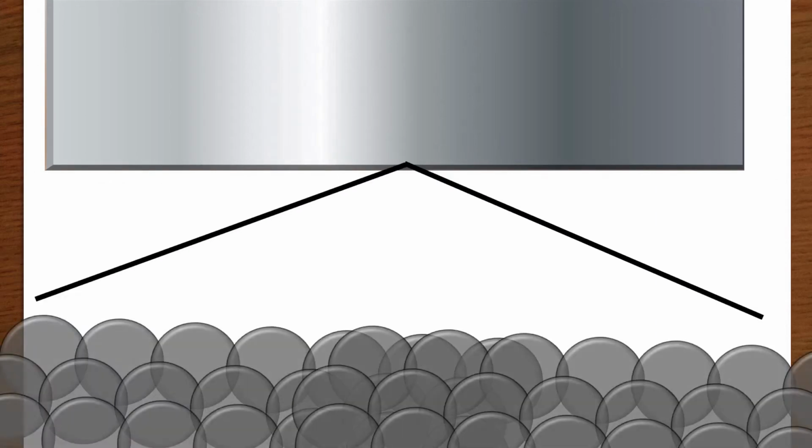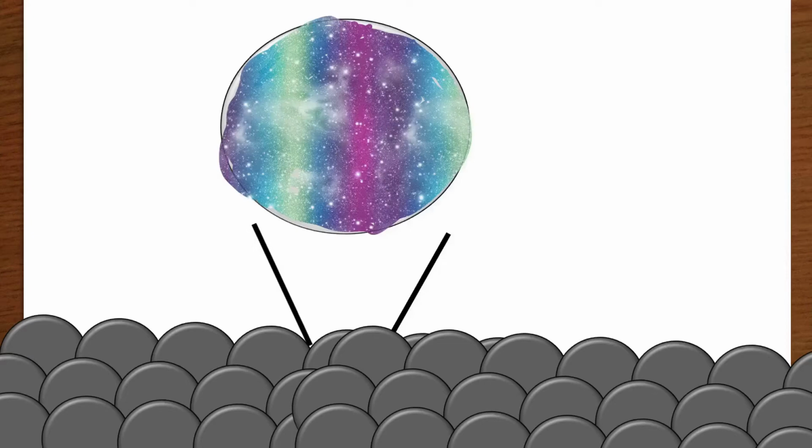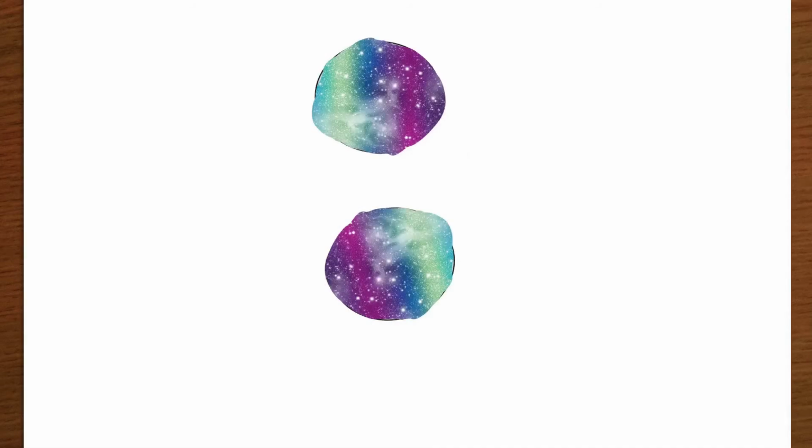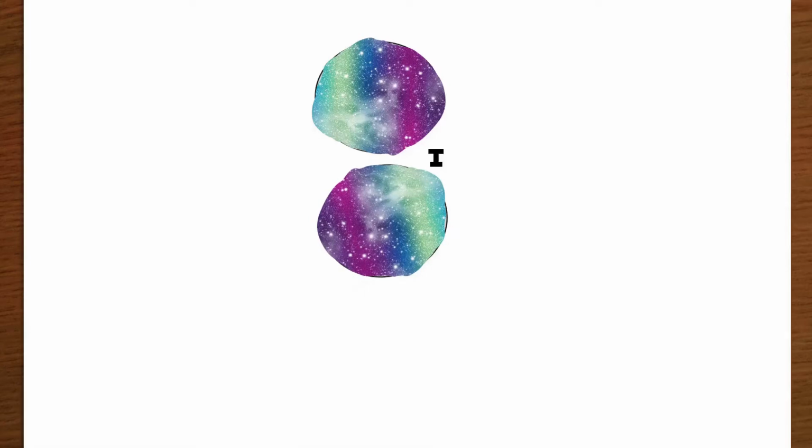First, let's picture the atoms of our two conducting materials as simple nuclei surrounded by electron clouds. These clouds represent the probability of finding an electron a certain distance away from the nucleus. When two objects are close together, all that separates these electron clouds is a small empty space that we call a vacuum. We can treat this vacuum as an energy barrier between the two materials.